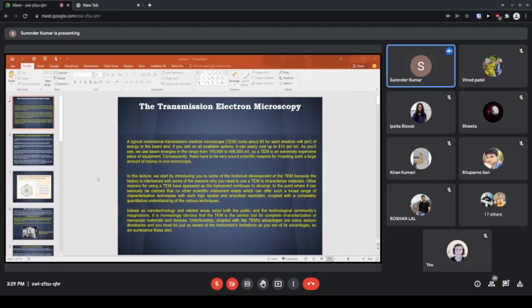Highlighted in yellow, the idea of being able to see with electrons may be confusing to you. I have taken this quote from somewhere: our eyes are not sensitive to electrons. If a beam of high energy electrons was aimed into our eye, you would likely be blinded, as the electrons kill your retina cells, and you would not see anything ever again.